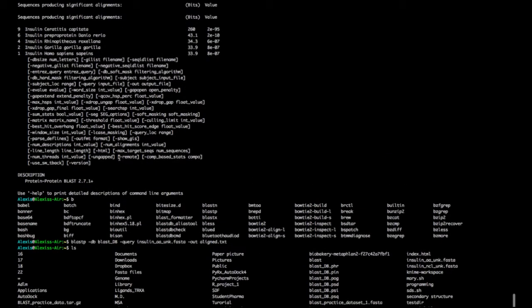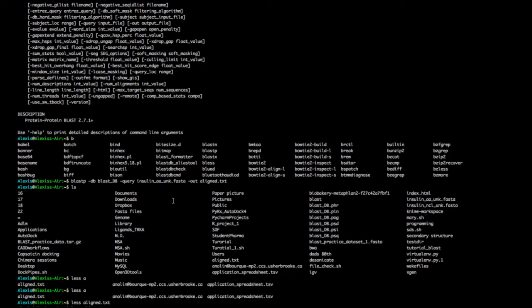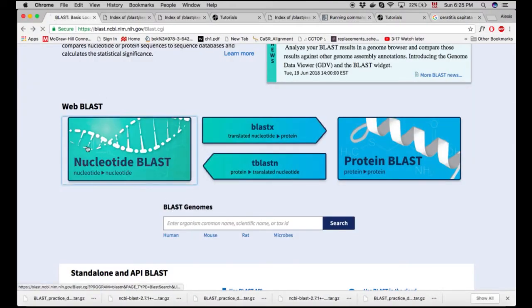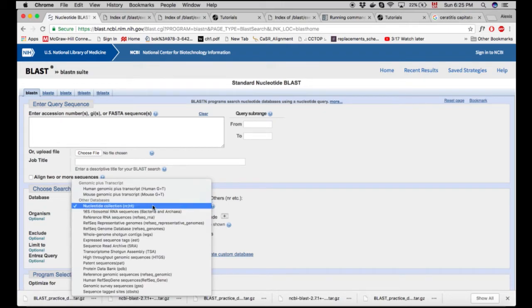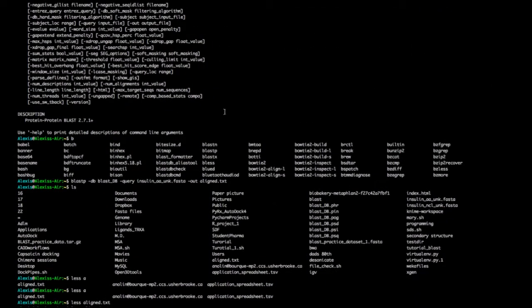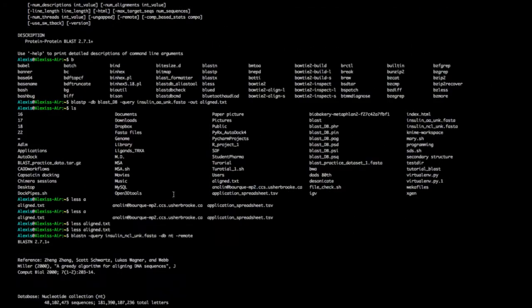The -remote flag will send the query to the servers offered by NIH. NT is one of their databases on the website — so we're actually sending our query to the website and receiving an answer back. Now it's running, and we're receiving data live as it happens. We're getting a lot of matches.